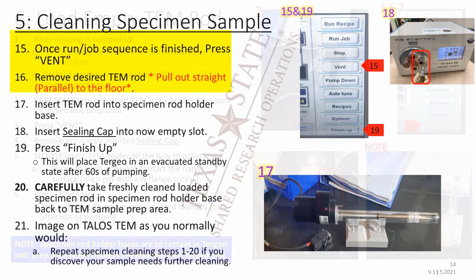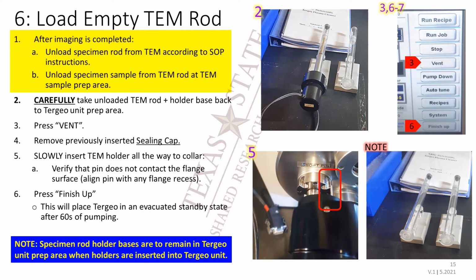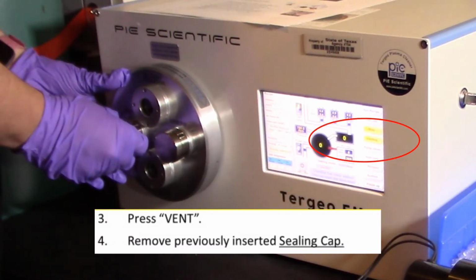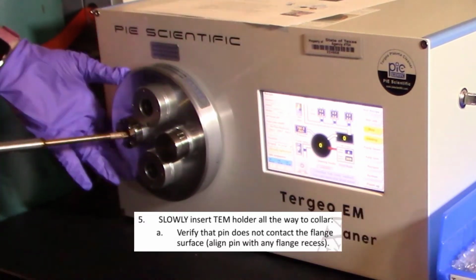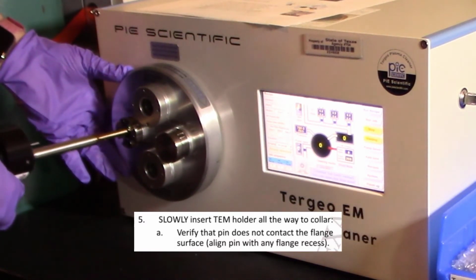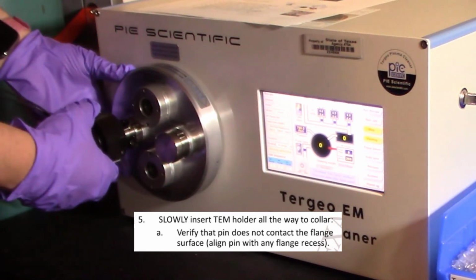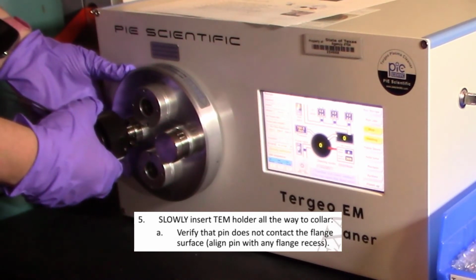After your imaging session is completed on the Talos TEM, unload the specimen rod from the Talos TEM according to the SOP, and unload your specimen sample from the TEM rod as you normally would. Carefully take the unloaded TEM rod in its holder base back to the Tergeo unit prep area. Press Vent and remove the previously inserted sealing cap. Slowly insert the TEM holder all the way to the collar. Verify that the pin does not contact the flange surface and align the pin with any flange recesses.